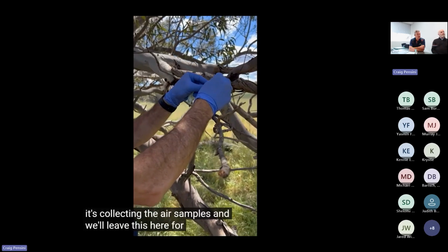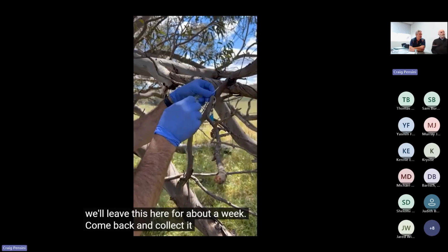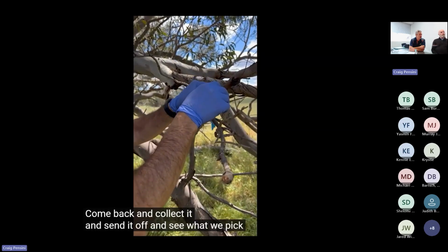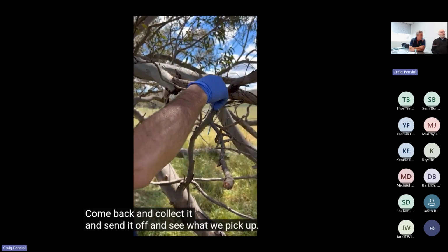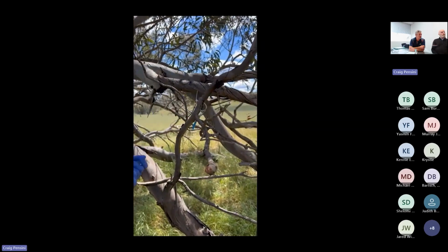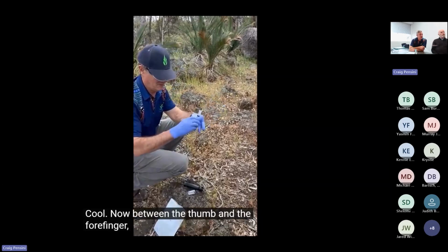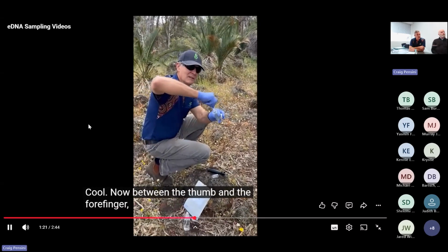We left ours out there for about 5 or 6 days before we went back and recovered the sampling tab, and then it goes off to the laboratory for processing. So basically it's sitting there capturing the DNA as it's circulating there. And this is the roller.